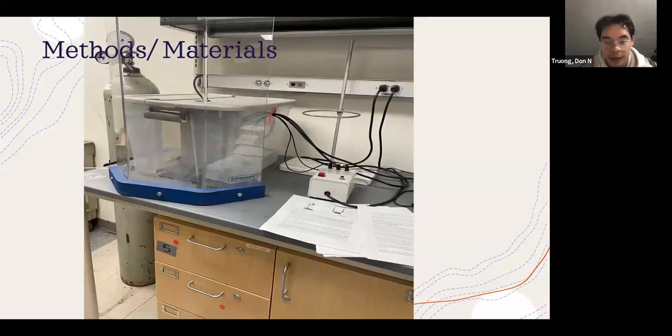And this is the setup that shows it. This red button here was just the ignition button. Once we let it stir for about 2 to 3 minutes, we hold this button in, and all you hear is a loud bang. No, I'm just kidding. That's not what you see or hear.